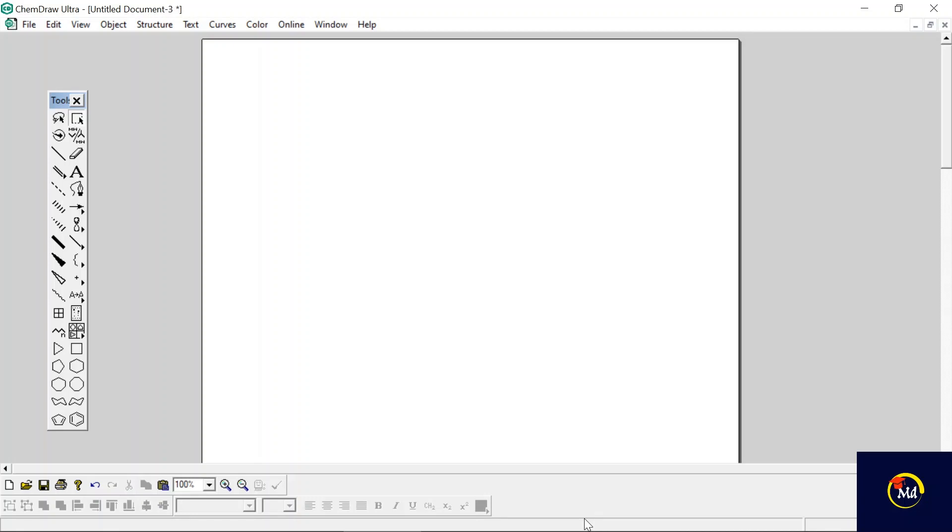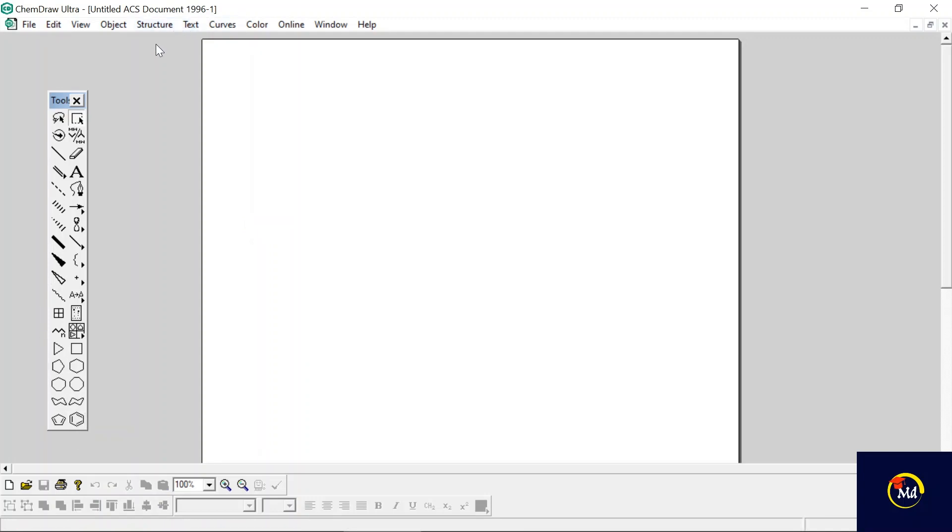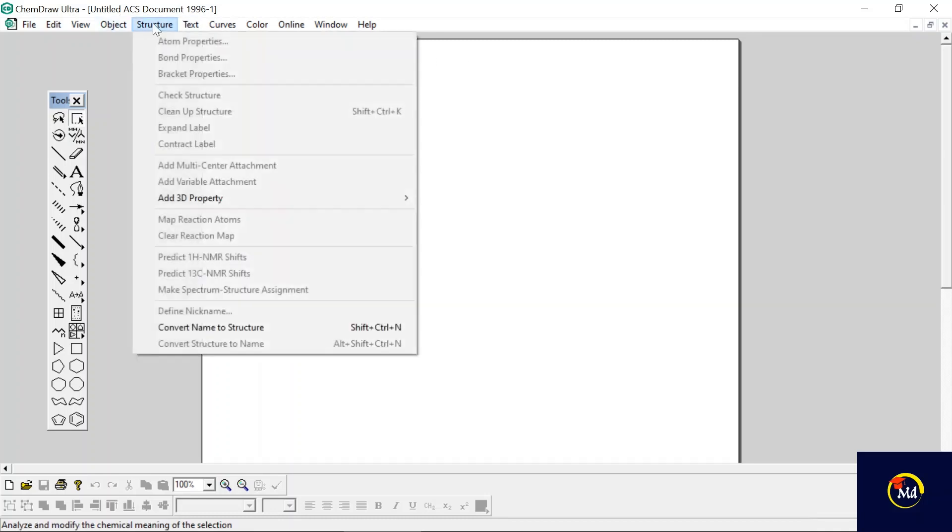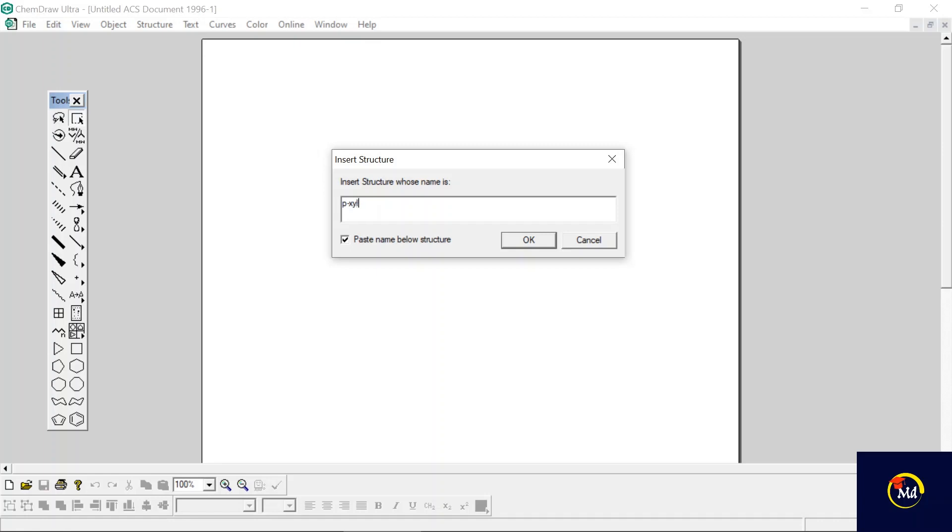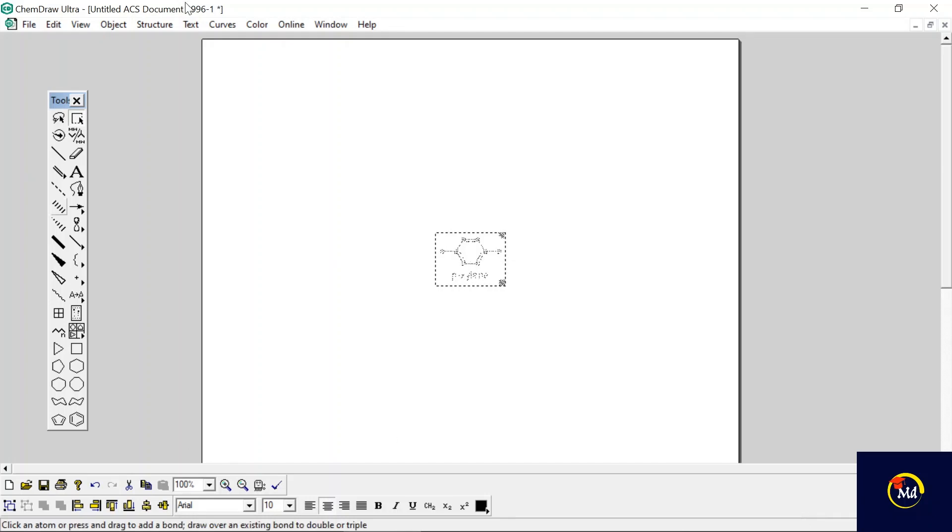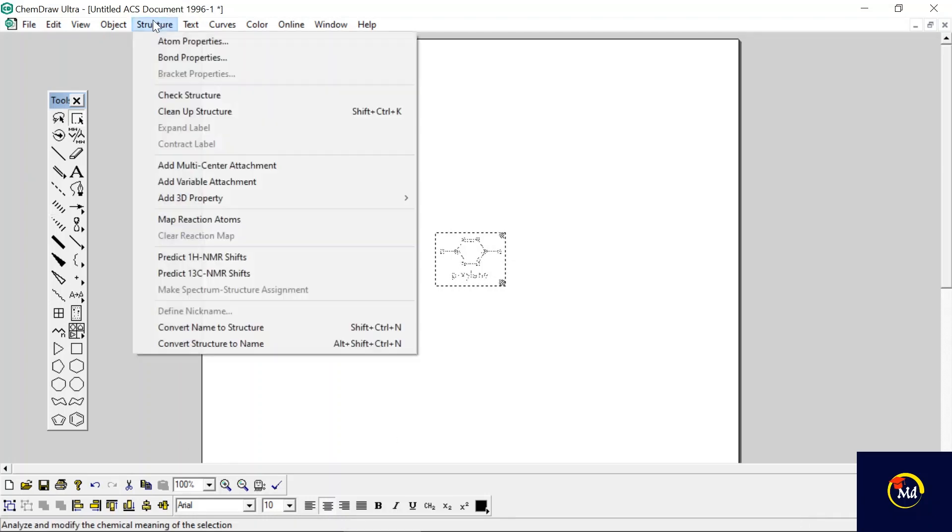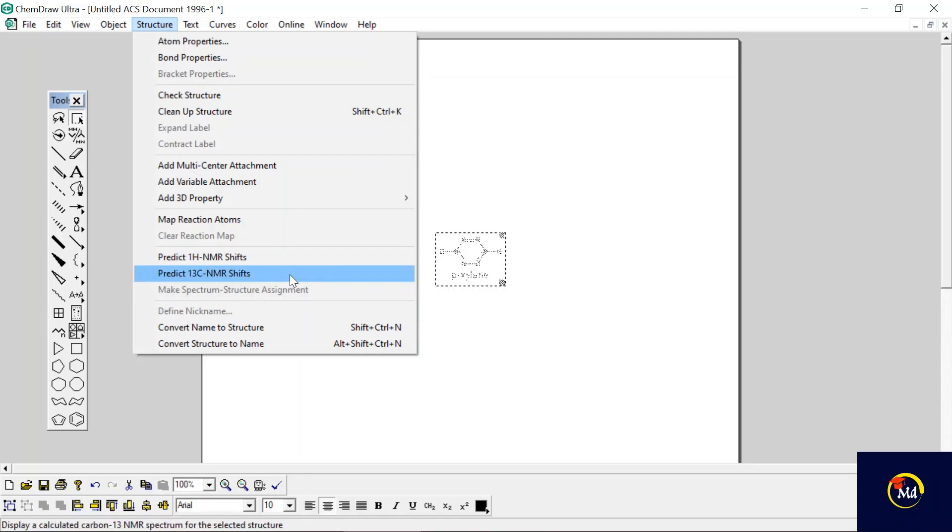Let's get started. Here I am taking para-xylene. I'm not going to draw each structure, I'm just going to the Structure menu and from here Convert Name to Structure, and writing here para-xylene. Then just click on OK. Now again go to the Structure menu above and you can see there are two options showing: Predict 1H NMR Shifts and Predict Carbon-13 NMR Shifts. First of all we will analyze the 1H NMR shifts.